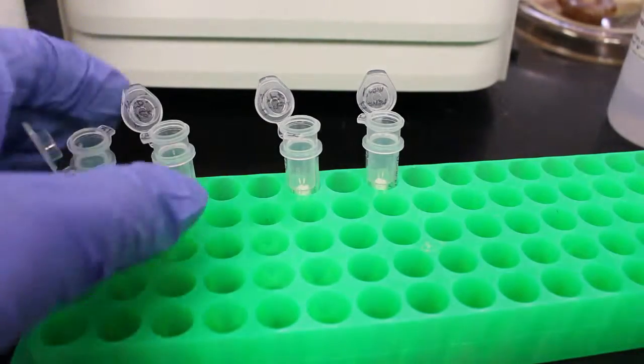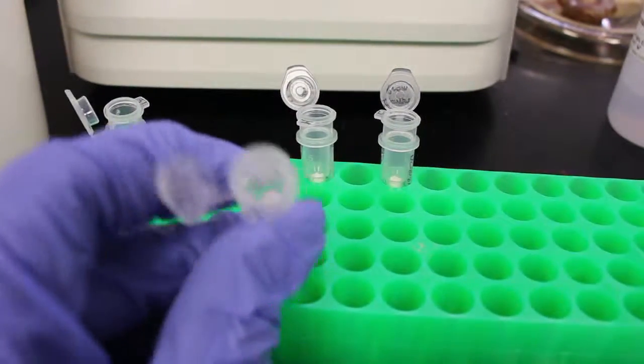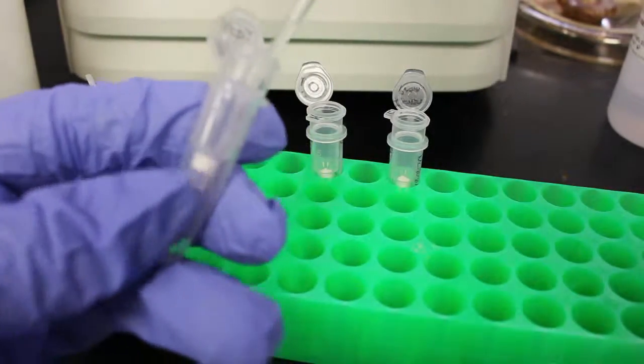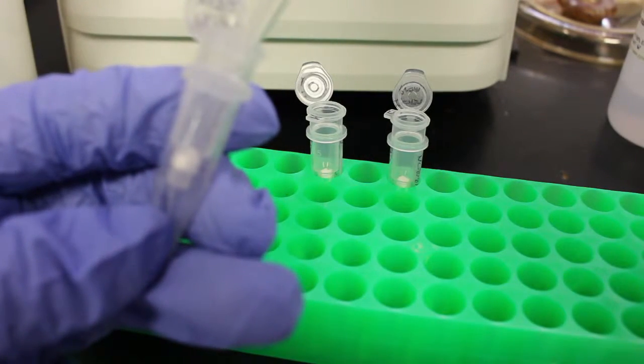Next, place the column into a new, clean, labeled 1.7 milliliter microtube. Add 30 microliters of USP water and incubate for 5 minutes. It's important that you add the water directly to the column, since we'll be working with such small quantities.